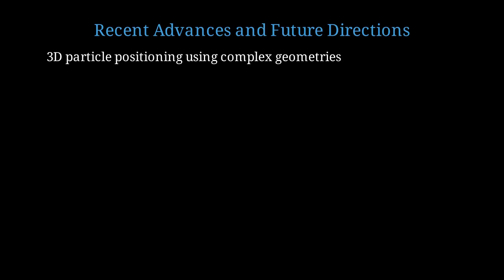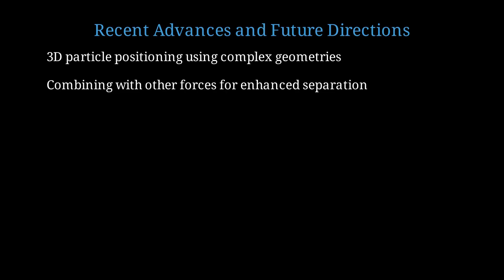Let me conclude by discussing some recent advances and future directions in inertial focusing research. Researchers are developing complex three-dimensional channel geometries to achieve more precise control over equilibrium positions in all three dimensions. There's exciting work combining inertial focusing with other forces like viscoelastic effects, magnetic forces, or optical forces to enable more sophisticated separations.